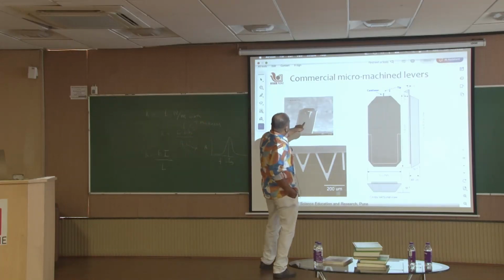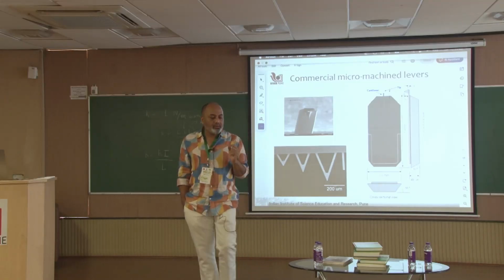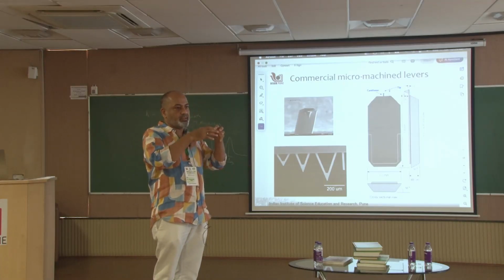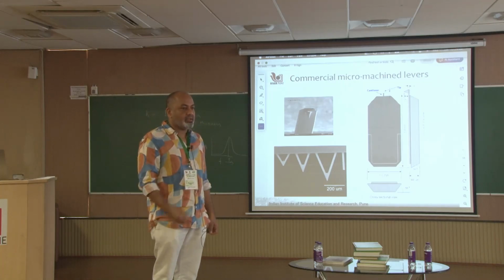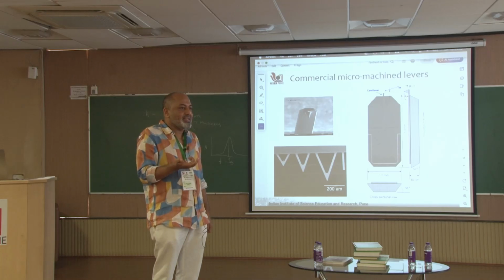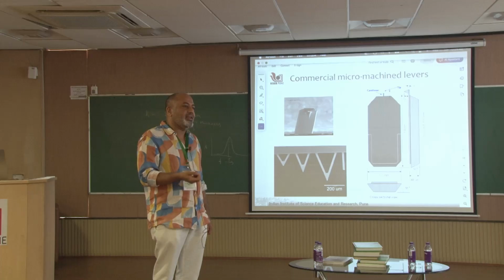Okay, this end, you're saying. Yes, the silicon cantilevers are pyramidal shaped, and they are somehow made, yes, sharp enough. They can be made as sharp as one atom at the tip. Now the question is, how do you know if it's one atom only? This is difficult, no? How do we see that this is only one atom? The moment you start getting atomic resolution with a tip, then it is a one atom tip.